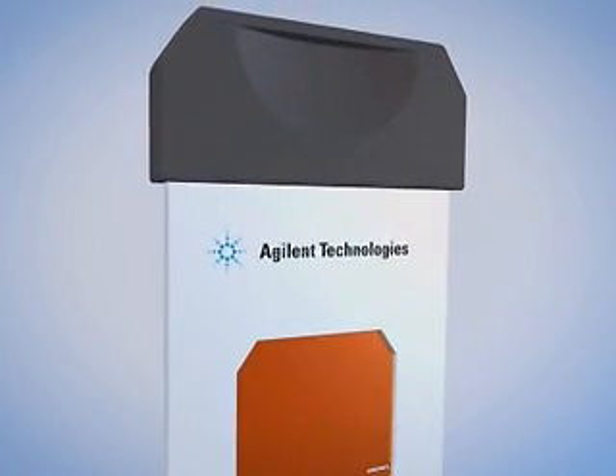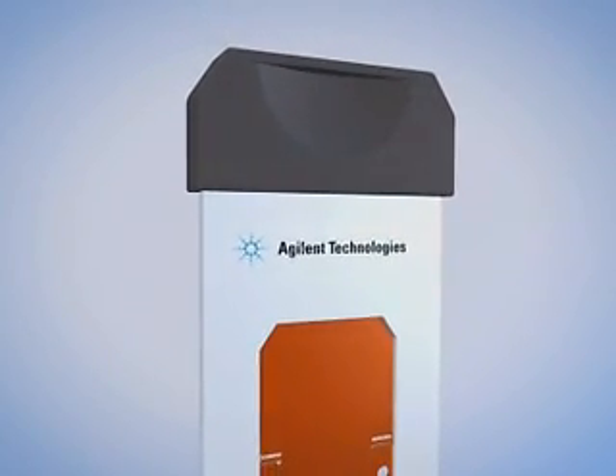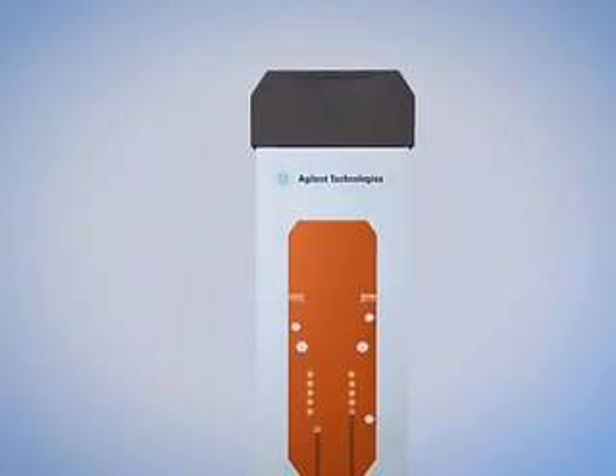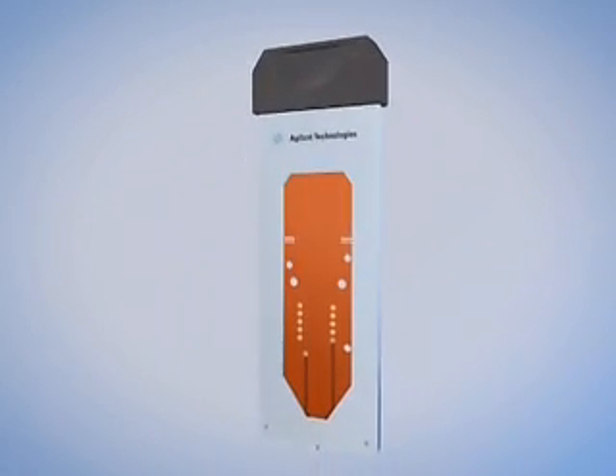This eliminates 50% of the traditional fittings and connections typically required in a NanoFlow LC-MS system, dramatically reducing the possibility of leaks and dead volumes, and significantly improving ease of use, sensitivity, productivity and reliability.